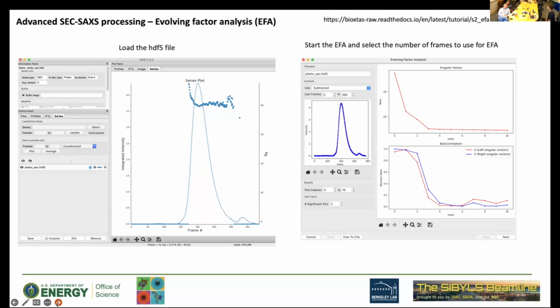And here's an example, and I'll show you how easily it can be done. You see there is some kind of different residual deviation in the front of the peak, then some fluctuation, then something going on here, and there is a little peak here. So obviously this is a very broad peak. Sometimes it is even more, like you can see a shoulder. You want to get as clean a sample, as small a dispersity as possible.